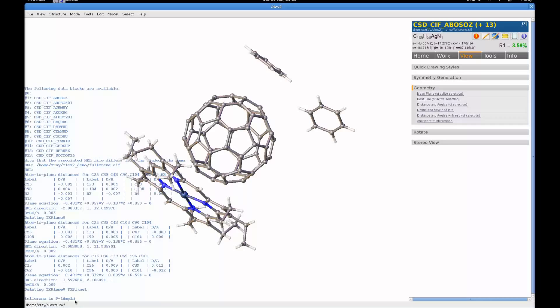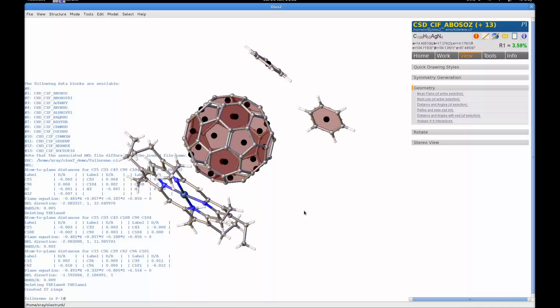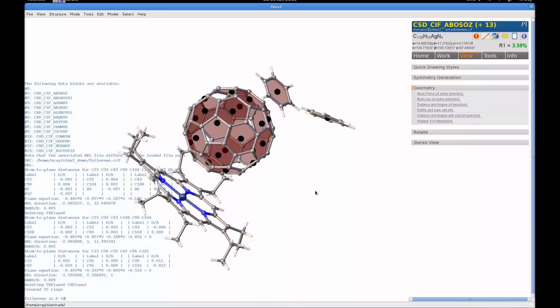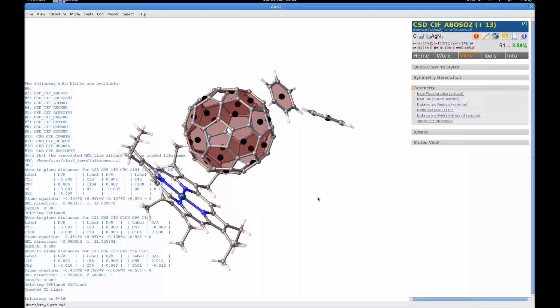If we type mplan, M-P-L-N, and then specify all of the rings. We want to use a subset of the rings. We're going to use all of the carbon six rings. As you can see, it's generated the six-membered ring mean planes.